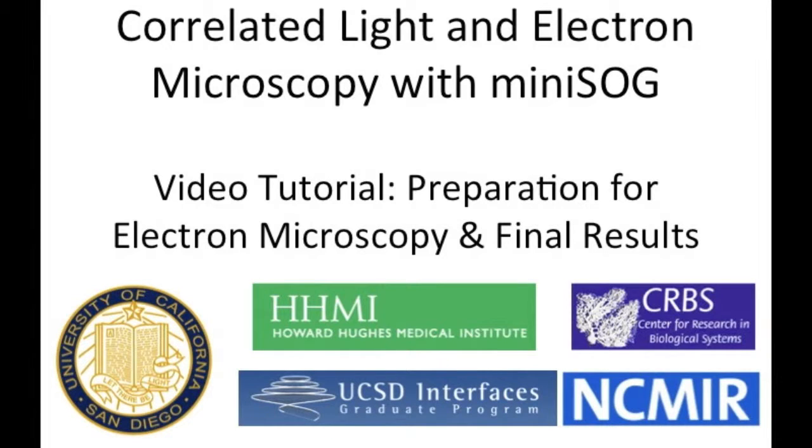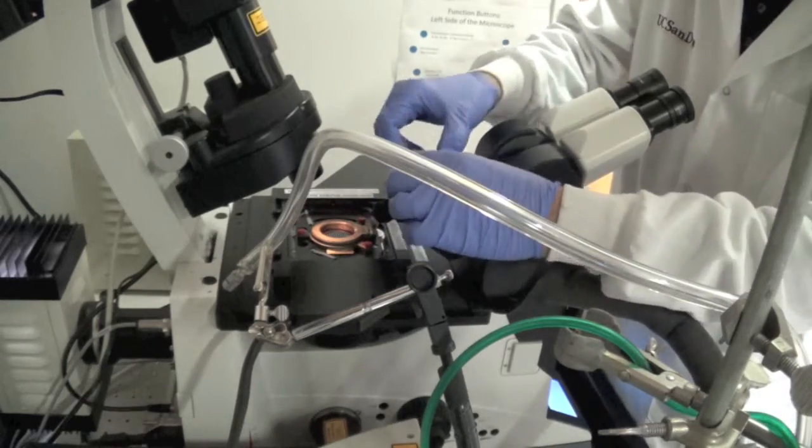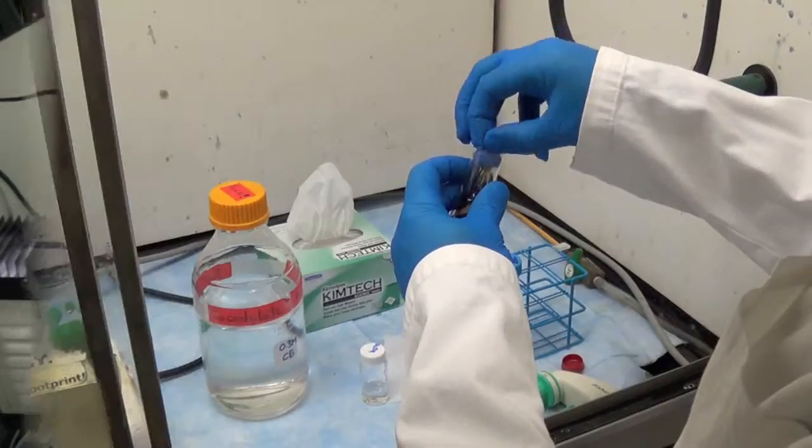This is the final video in a four-part series on how to perform correlated light and electron microscopy with miniSOG. This video will cover how to prepare your photooxidized samples for electron microscopy, with a brief guide to interpreting results.